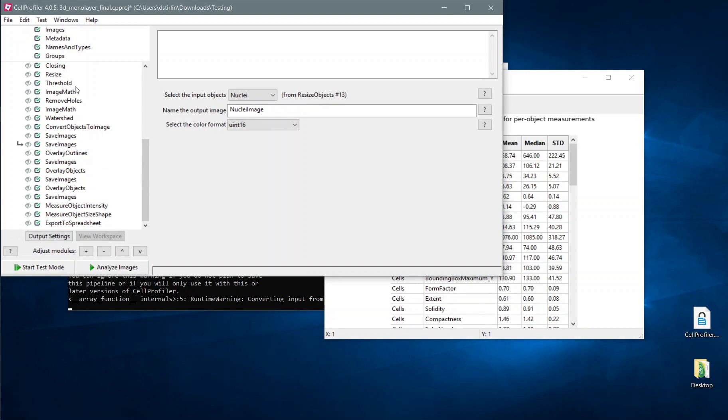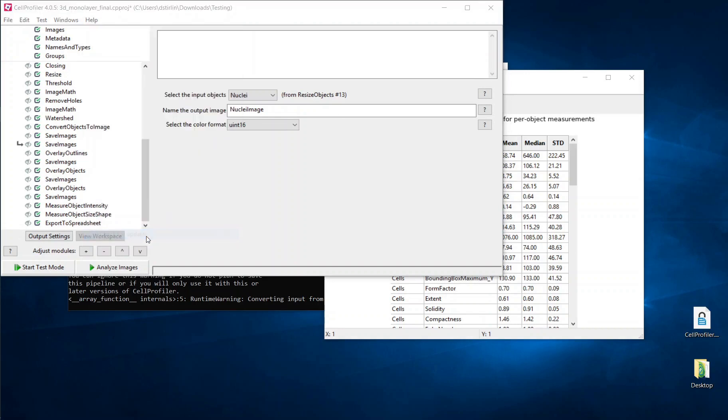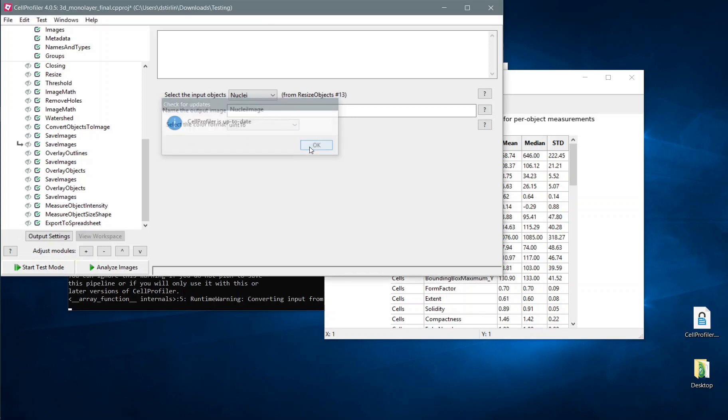Another small feature we have added is the ability to use the Help menu to check for updates to CellProfiler. This will let you know if there is a new update available, and there's a more recent bug fixed version of CellProfiler. That's all we have for now. Hope you enjoy CellProfiler 4. Thank you.